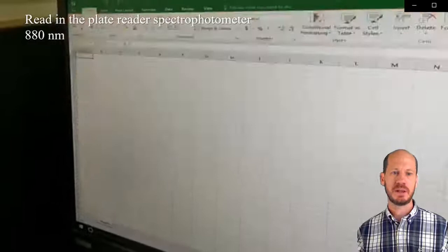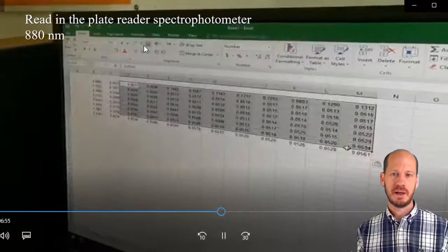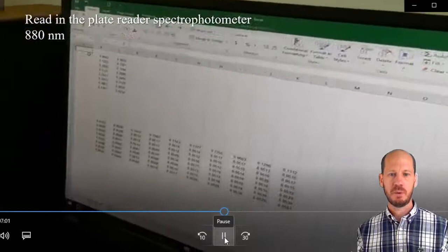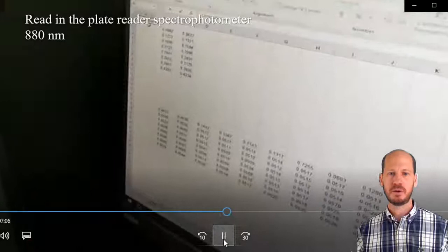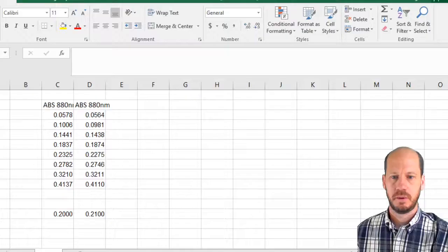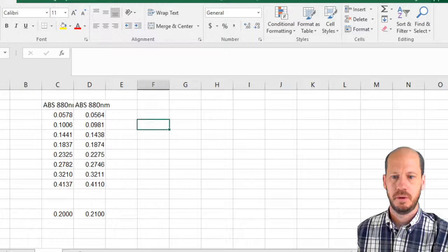This is opening the data in Excel, and then you can copy this to a new spreadsheet. This has the same layout as your plate: 8 rows and 12 columns. The first two are the curve, and you have your samples where you placed them. I will shift from the video and go to Excel to show you how to treat your standard curve and quantify the phosphorus on your samples.